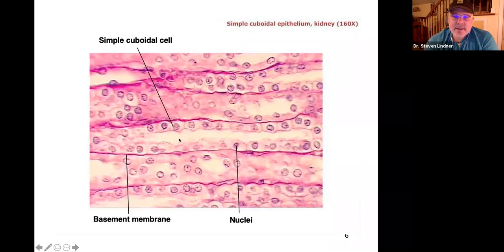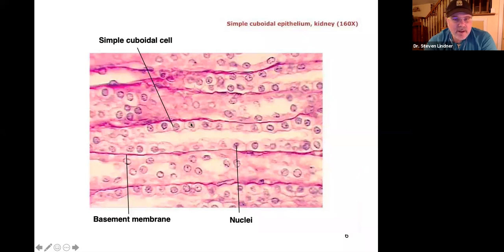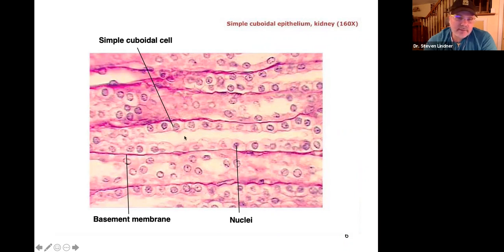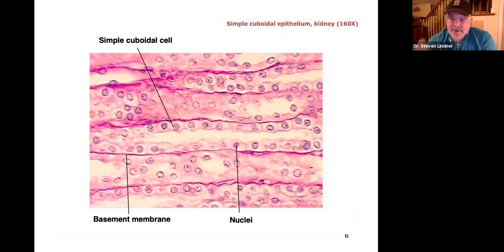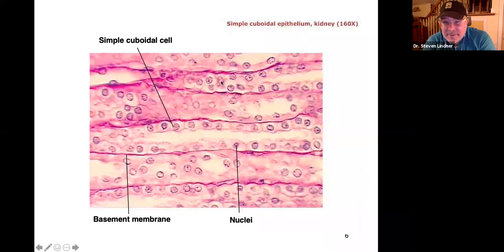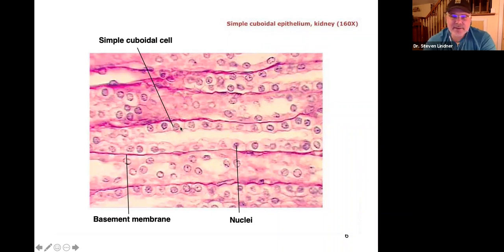These cells look cube-shaped. Here's the lumen — these are cube-shaped, not flat, and one cell layer thick, so they're simple cuboidal. These are found in the kidney tubules: simple cuboidal epithelium. Here's one tubule, and here's another. No doubt — one cell layer thick, closely packed together, it's epithelium, one cell layer, cube-shaped: simple cuboidal epithelium.